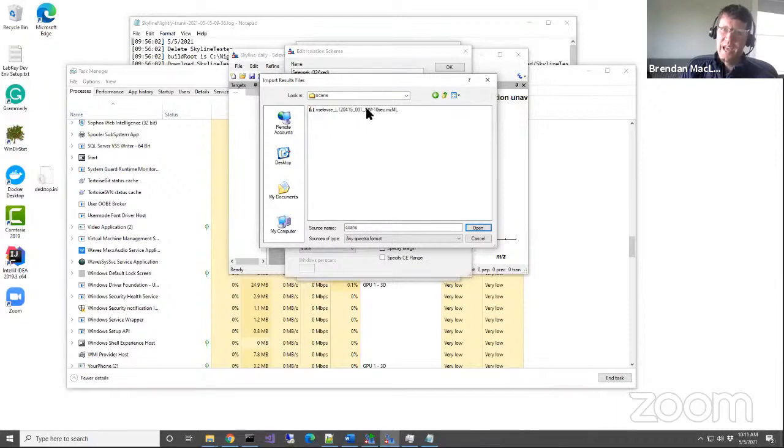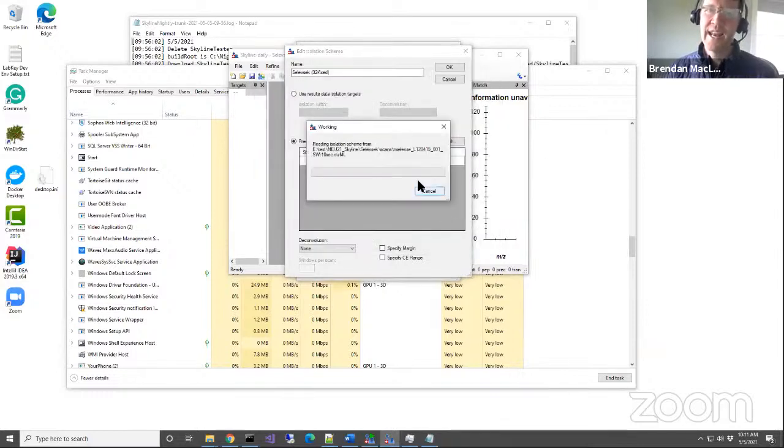And then we have this little mzML file, and I made it really small so that I can include it. These are like 5 gigabyte WIFF files. So you're going to end up with a Skyline batch configuration that will allow you to run this analysis, but you're not going to do it here during this time, because this is an even bigger download. And if you had problems getting the Bruker data set down, you really want to make sure that you're on a computer with a high-speed network. So click open on that.